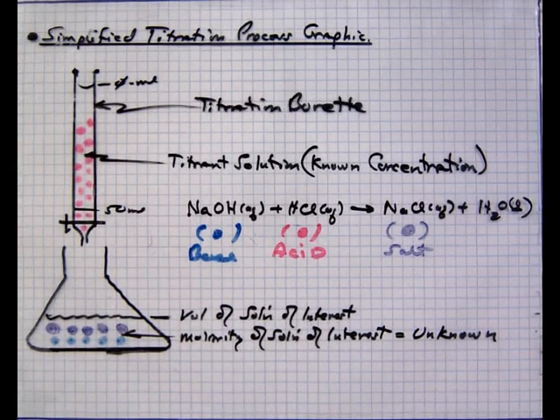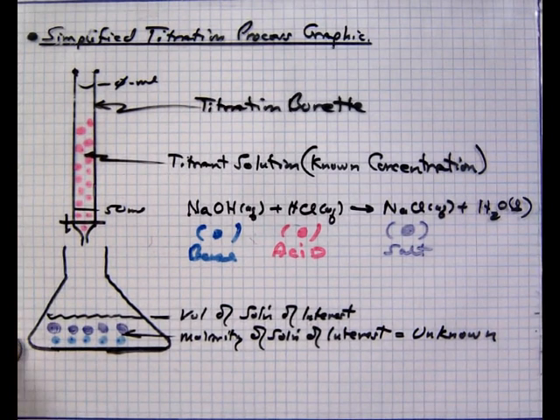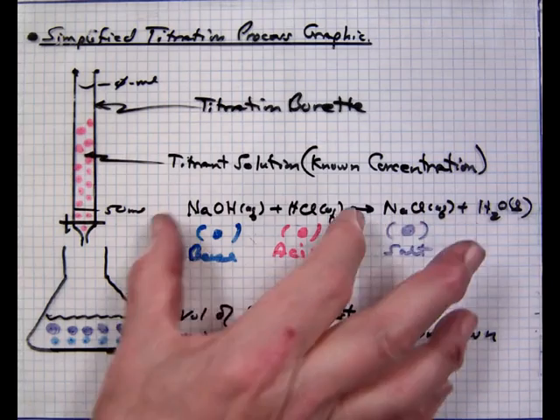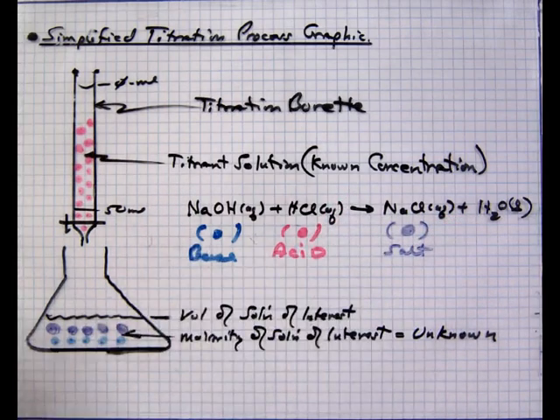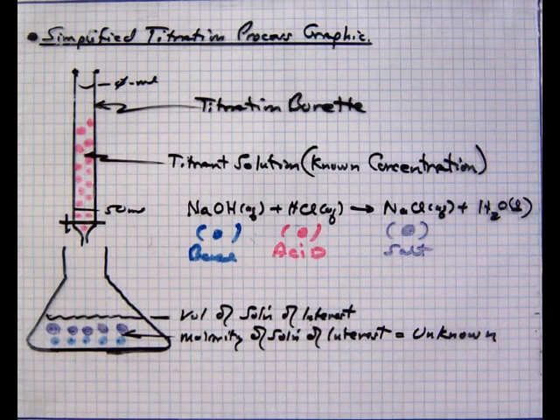Okay, we're halfway to the equivalence point now. Equivalence point, you recall, is when all of the reagent has been converted into salt and you have no acid and base remaining. There will be only salt at the equivalence point, and of course new water if you want to think about that.